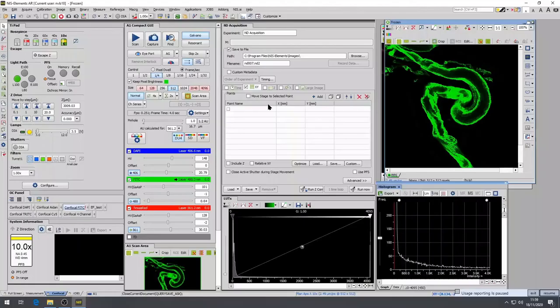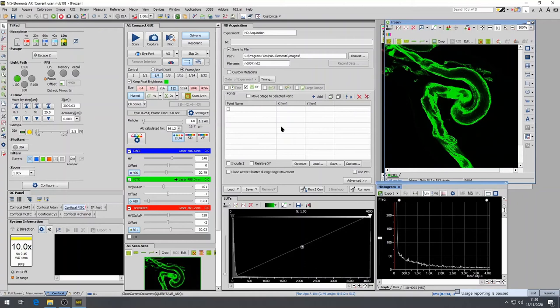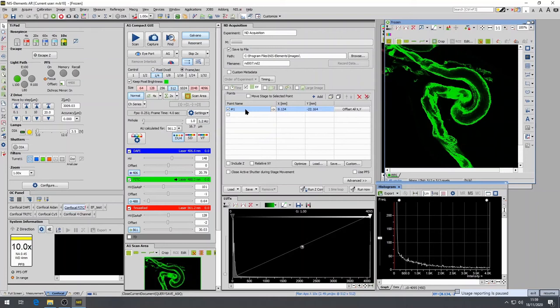For time-lapse imaging, it is usually of interest to follow multiple points, for example multiple cells, throughout the course of the experiment. The Nikon Elements software with the motorized XY stage allows you to save multiple regions of interest. This is done under the XY tab of the ND Acquisition panel. This panel will show the physical location X and Y of each point.